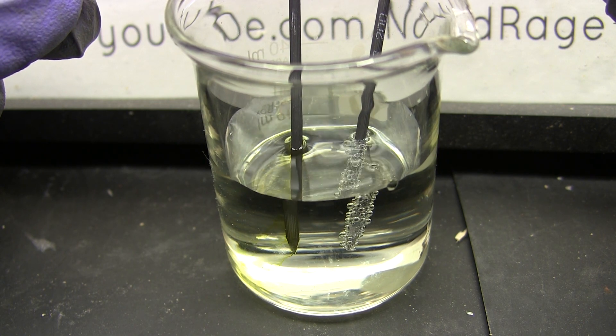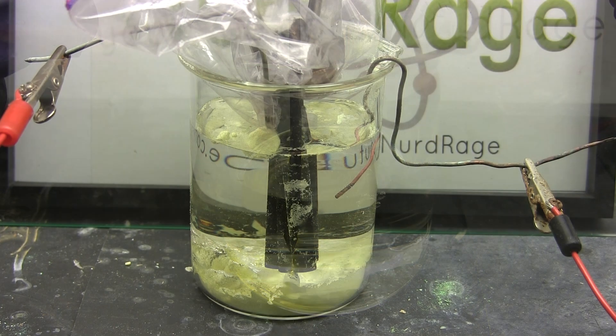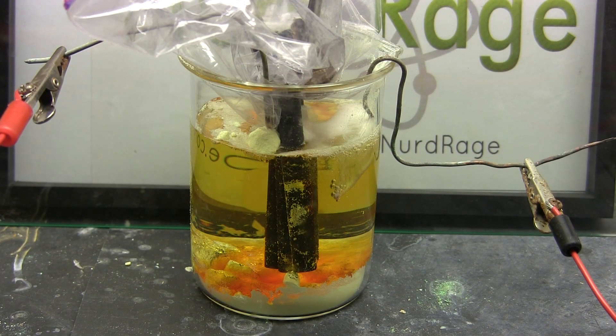Greetings fellow nerds. In this video we're going to make hydrobromic acid. In a previous video I used it to make sulfuric acid from sulfur and water, but since hydrobromic acid is not easily obtained in and of itself, we'll need to make it from domestically available chemicals.